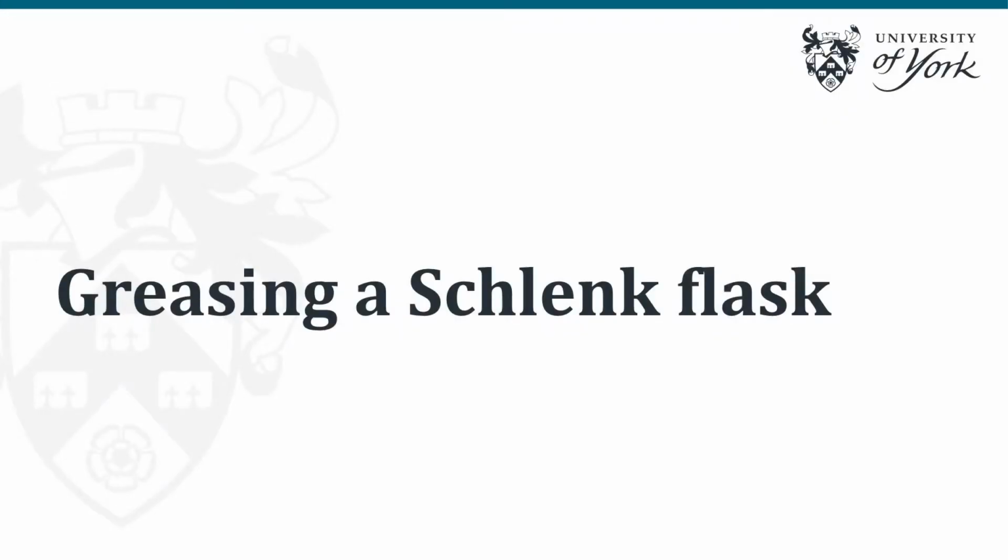Hello and welcome to this video on how to grease a Schlenk flask. It may seem straightforward and something that you would just naturally be able to do, but of course greasing is very important on the Schlenk line. As we're working at low pressures, greasing the taps and the fitted glassware is really important to maintaining that low pressure and avoiding any leaks.